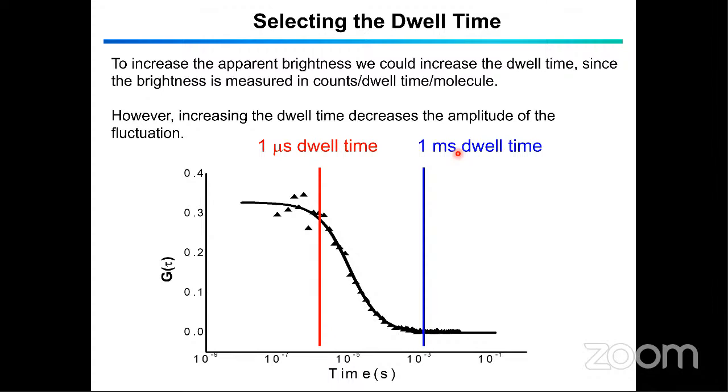What you can do there is use some kind of stroboscopic illumination. So even if you expose longer, you just give a flash of light, very short, maybe 100 microseconds or something, and then you will also again be able to see those fluctuations. So this is important if you are trying to do number and brightness on your camera-based microscope, like your TIRF instrument or light sheet or something else.